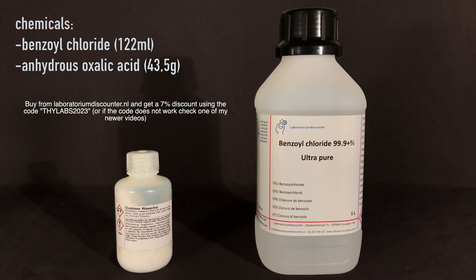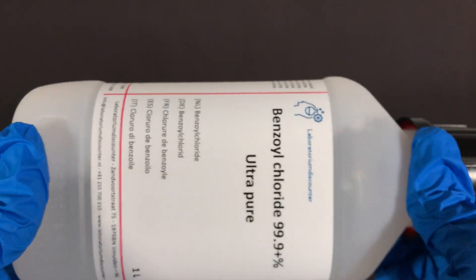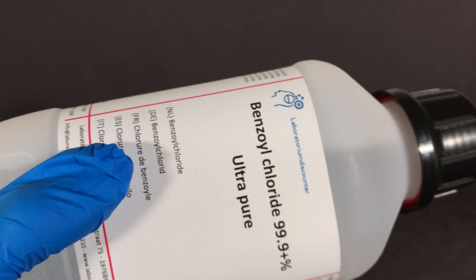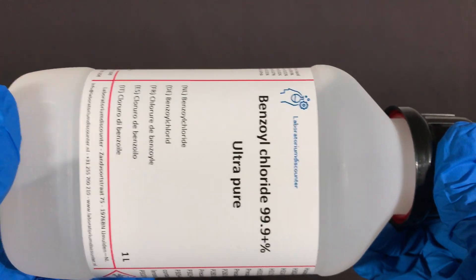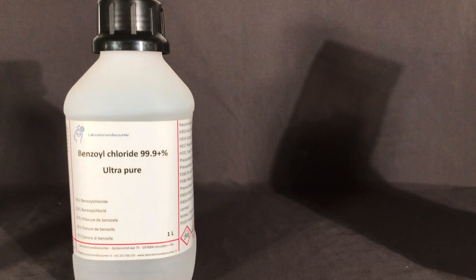For this you're going to need 122ml of benzoyl chloride and 43.5g of anhydrous oxalic acid. Benzoyl chloride is one of the chemicals that Laboratorium Discounter is now selling as an ultra-pure chemical, so make sure to check out their store and if you do, use my discount code.